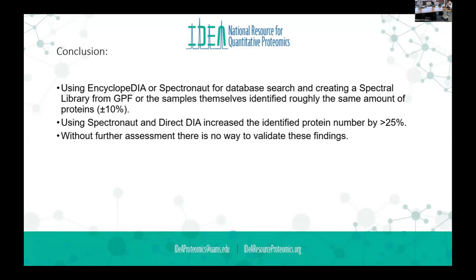Whereas Spectronaut, I would say, has probably an order of magnitude more dials, to its detriment to some extent, right? It takes a while to become an expert with Spectronaut. And even if you read, I think, the 100+ page manual, we still have questions on a regular basis that we have to fire off to them. A lot of the terminology they use isn't necessarily standard or familiar to me. And so kudos to you for being able to even compare these two and get the parameters as close as possible. But what can you say about the additional features Spectronaut brings?